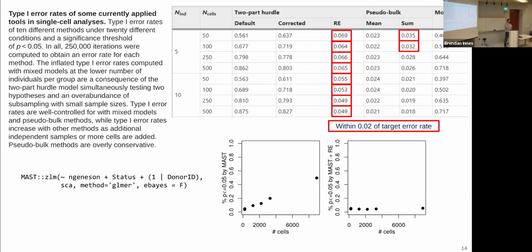droplet-based. I agree with you. I've always been sort of of the opinion that the nice thing about droplet-based stuff is it's so noisy that other sources of noise get lost in the noise. Like batch effect, I think, doesn't matter as much in droplet because droplet is noisy and batch is just more noise, so who cares? It's the reason the meta-analysis methods work so well on droplet stuff.